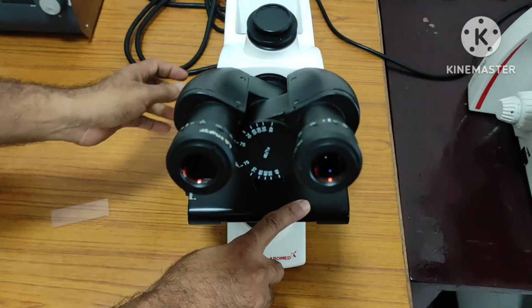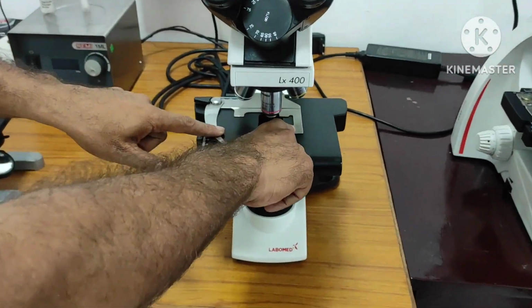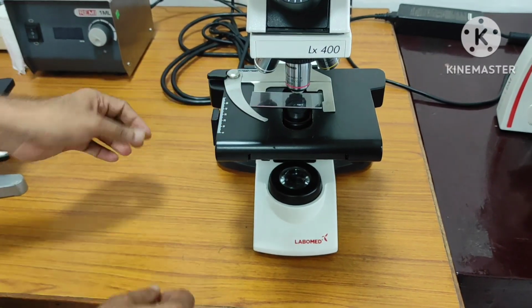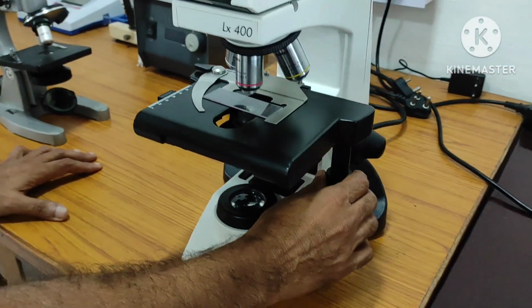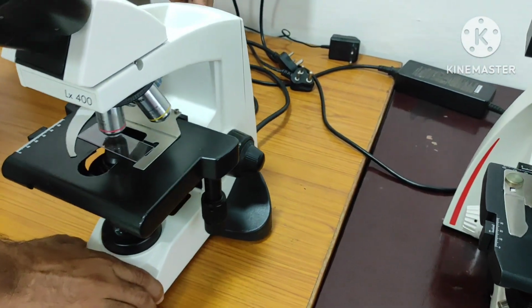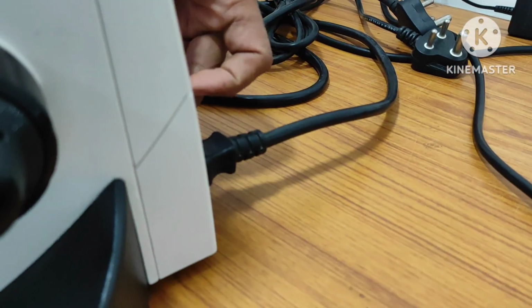This is the stage. As we saw in the compound microscope, simple type of compound microscope, in that we saw this is the stage. These are the adjustable clips, right? A slide can be adjusted here like this only, right? And here facility is there for adjustment of these slides also, it can move like this. What is important here, it is connected with the wire here, electric circuit here, and if it is connected, then we can switch on and use it.